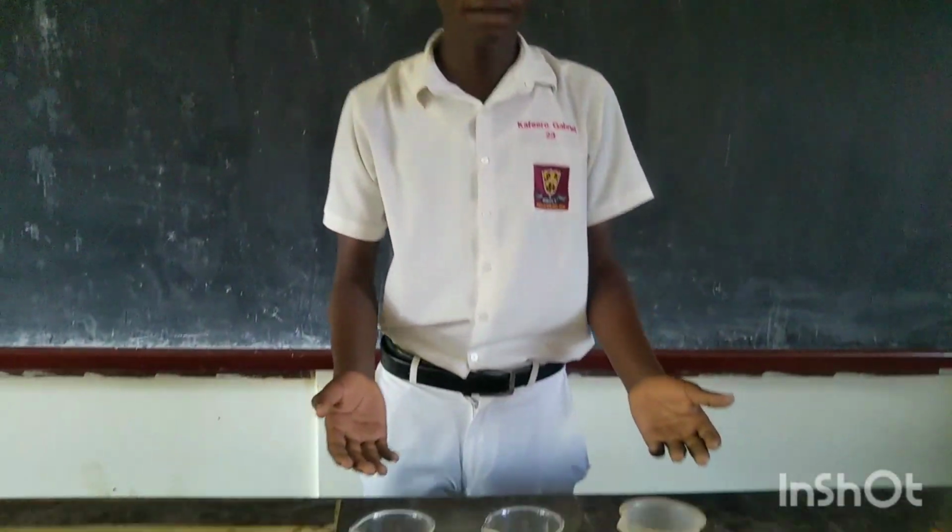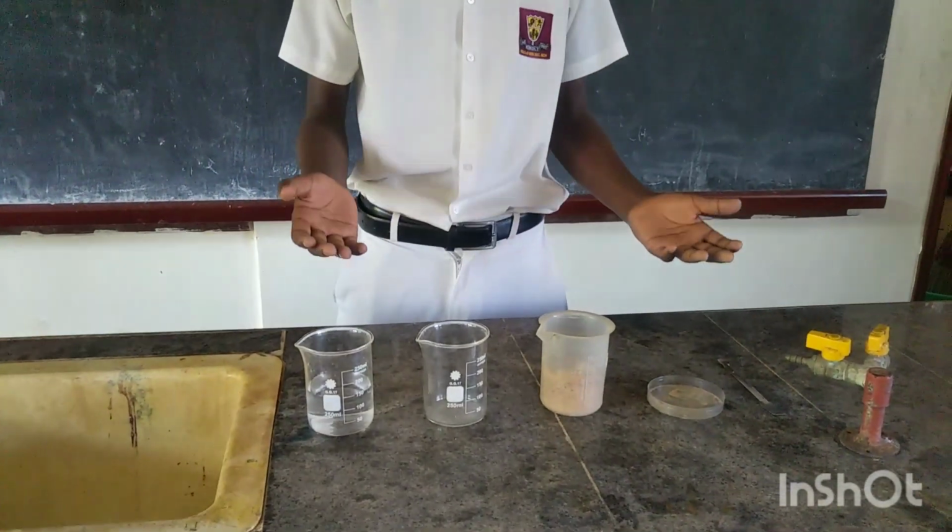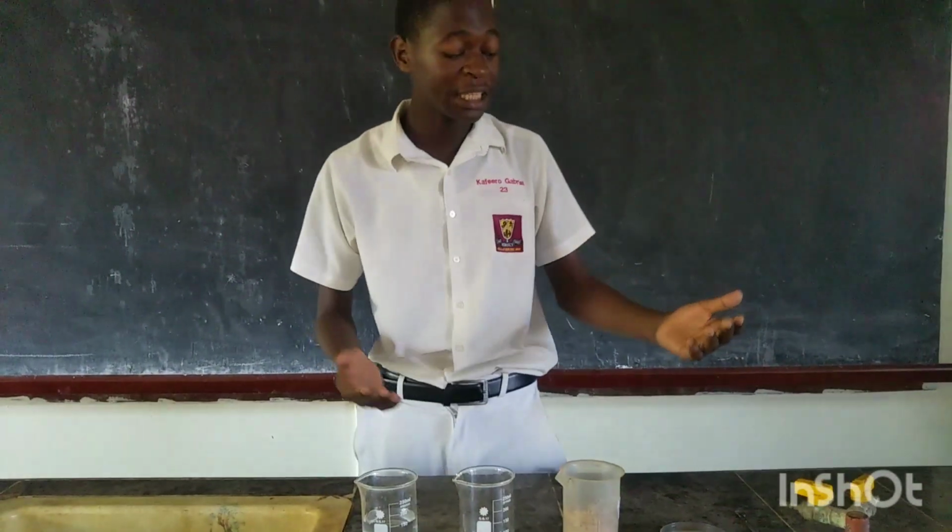Remember, there are different types of methods used for separating substances. For today, I'm going to use the decantation method for separating my water from sand. As you see in front of me, I have some things, so let me begin explaining them.